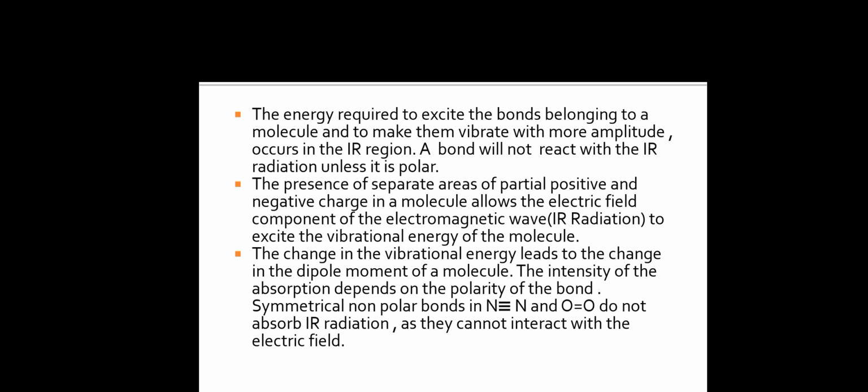The change in the vibrational energy leads to the change in dipole moment of a molecule. The intensity of absorption depends on the polarity of the bond. Like symmetrical nonpolar bonds like N2 and O2 do not absorb any IR radiation as they cannot interact with the electric field.